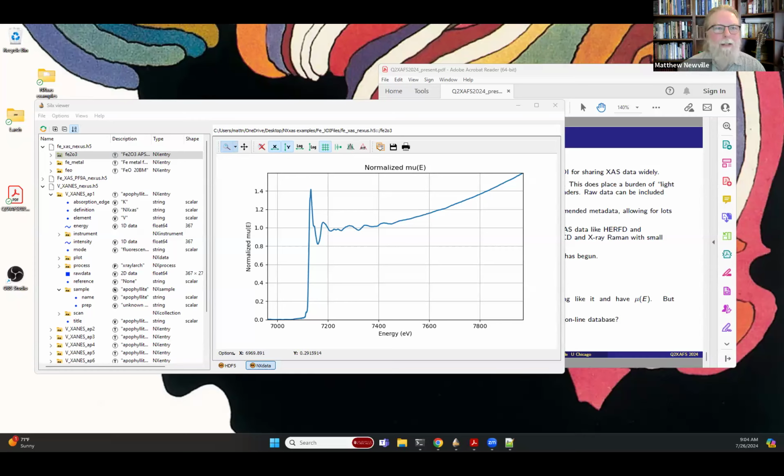So my view on that is that XAFS is always on the small side compared to synchrotron data, and what Nexus can handle, no problem. What a data portal can handle, not really a problem. I'm going to say for 100, let's just go to 100 element detector. If you're saving ROIs, that's fine.